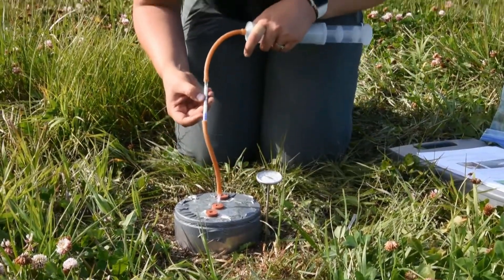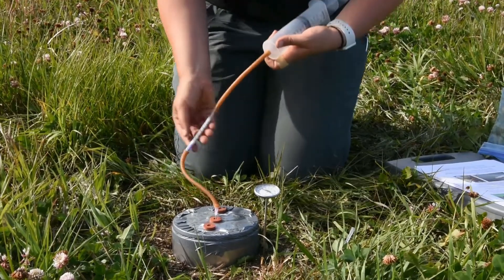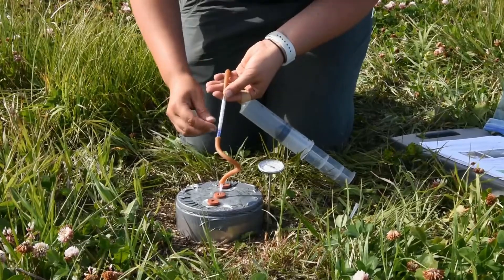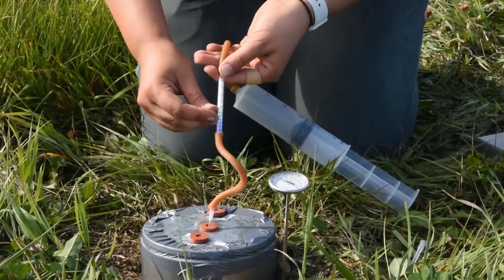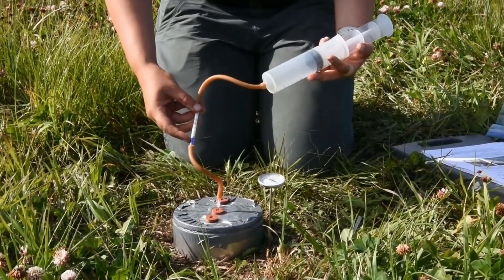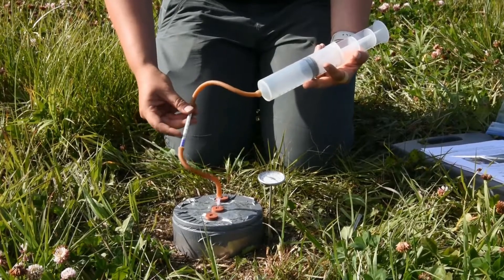Now if the reading is less than 0.5, you're going to want to take four extra 100-milliliter draws of the sample. As you can see here on the Draeger tube where it says n equals 1 — meaning the number of draws was 1 — we are sitting at about 1.25 or 1.5. So we only need to take one measurement for this sample. If your first measurement is 0.5% or less, you'll want to repeat this process four times for a total of 500 milliliters of air through your Draeger tube.